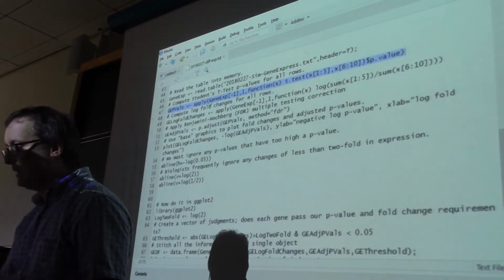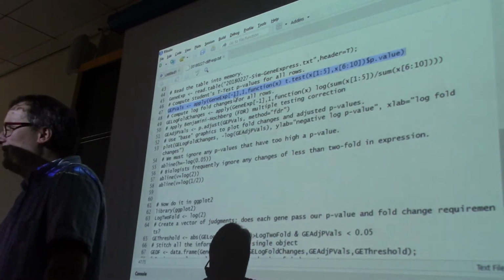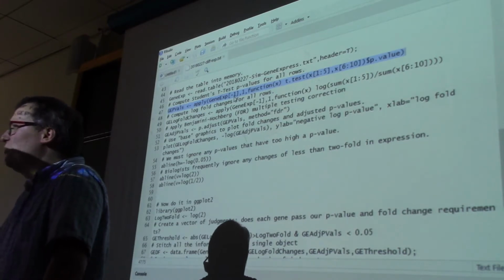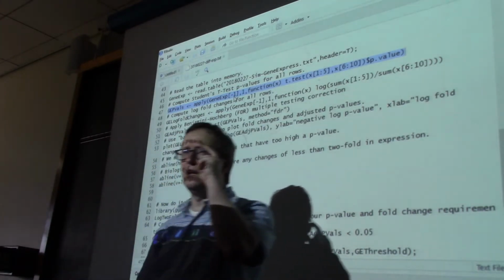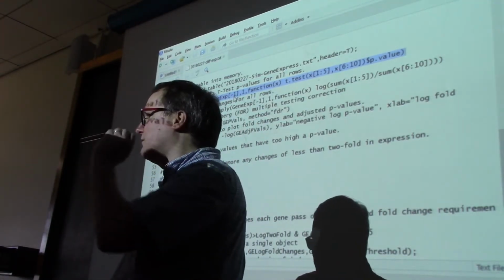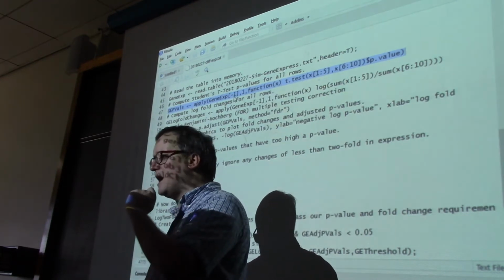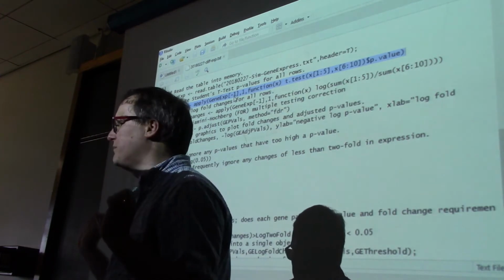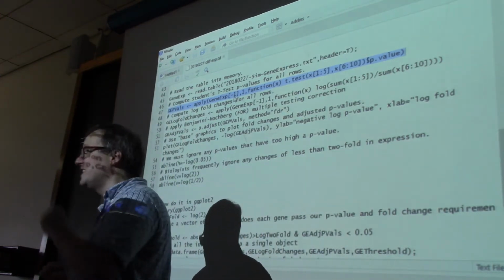And in our apply, we're using a special kind of indexing on it. Everyone see that? The little square bracket, -1, square bracket. So what does that do? What does -1 mean? We said yesterday that if I wanted to grab out just the first column of gene expression, I might say gene exp bracket 1. But what's this -1 business? -1 is actually a special bit of syntax for indexing.